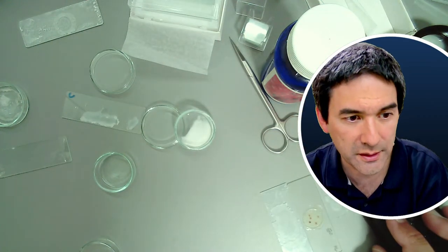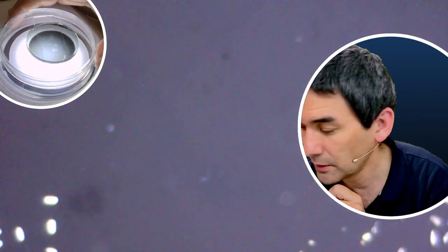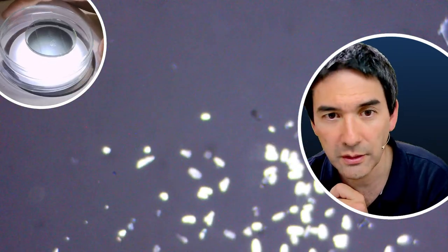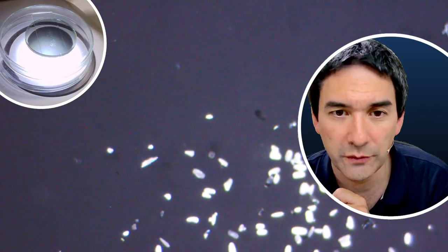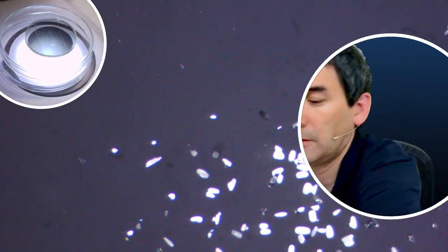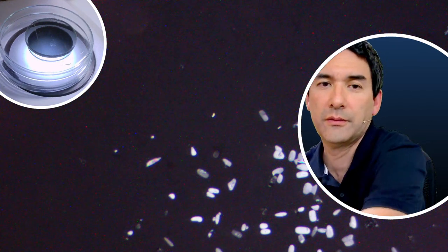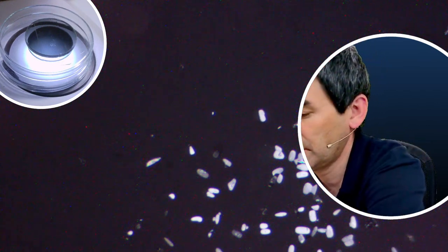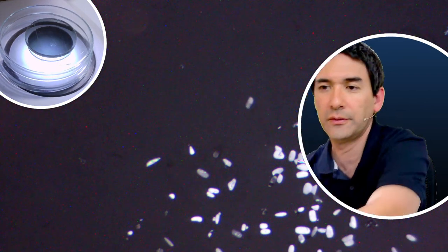And a stereoscope we want to have. Let's see if I need to. Okay, it found it. Where is it? Yeah, here are some of those crystals. They are not dissolved yet. Maybe just the light a little bit here. Yeah, the exposure time is a little bit slow. And let's wait for the alcohol again to dissolve.